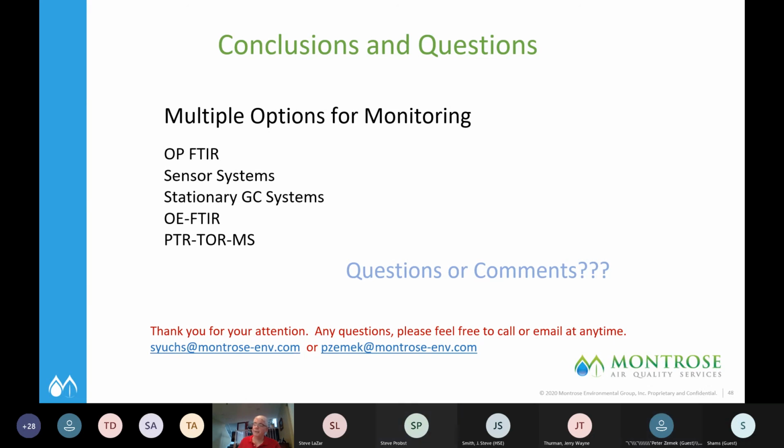Or another way you can do it is you can also take a full vial sample with no headspace, seal it, and send it to our sister lab, Enthalpy, and they will do a stripping and collecting purge and trap GC test on it, where they will take that water, put it in a system, bubble it, collect everything on an absorption trap, and then desorb it and flash it to an instrument to determine the quantity.